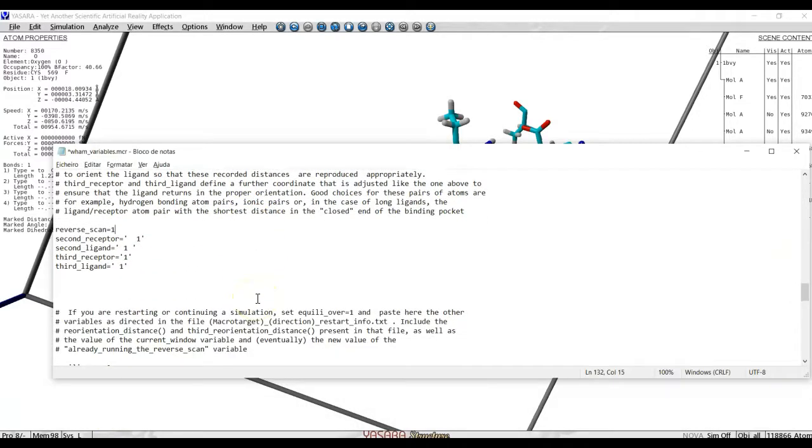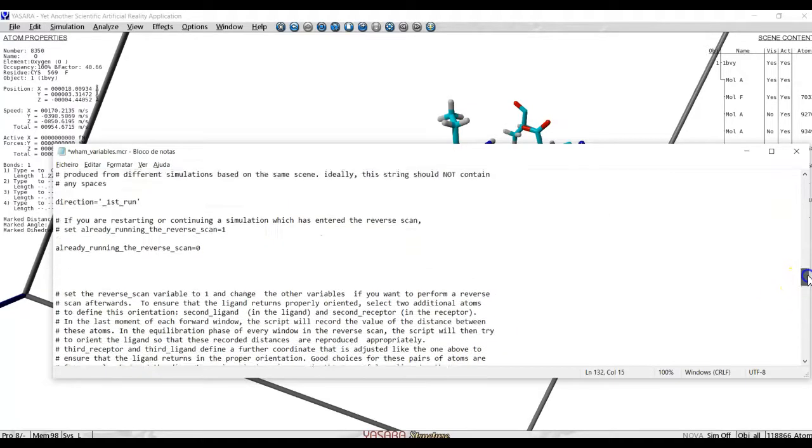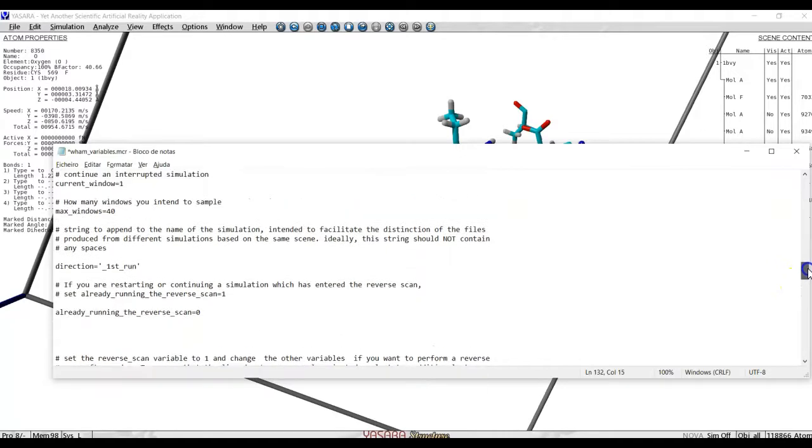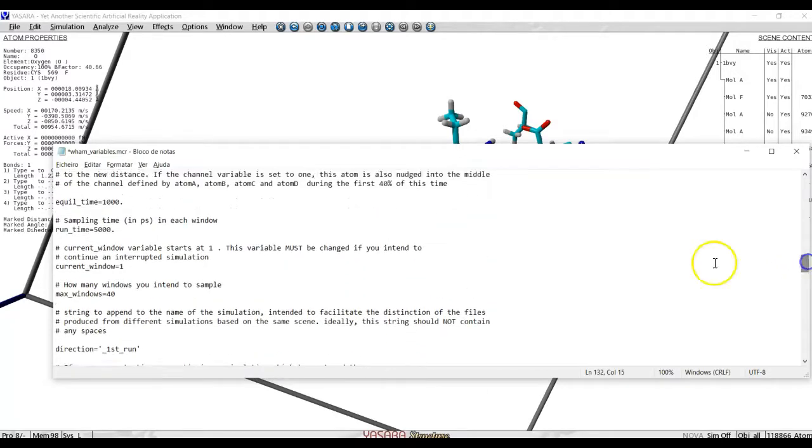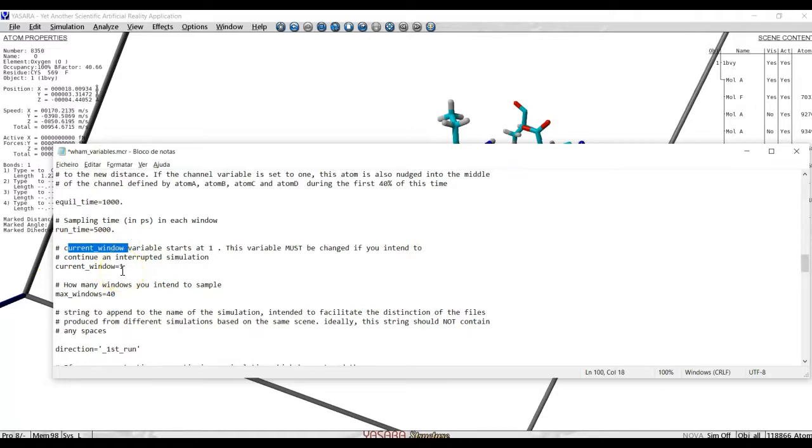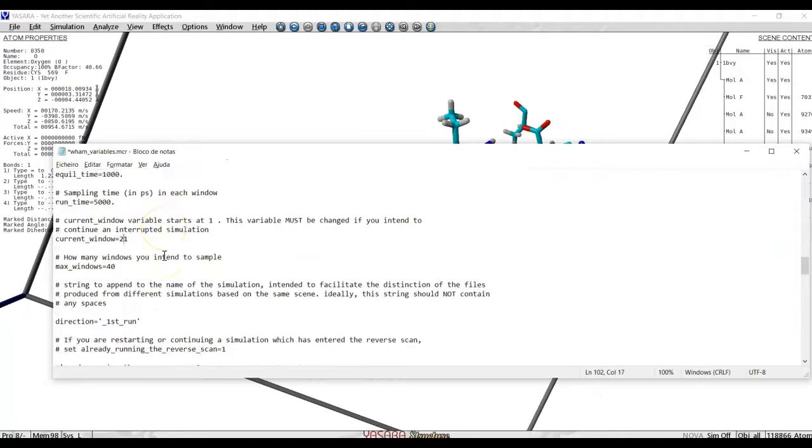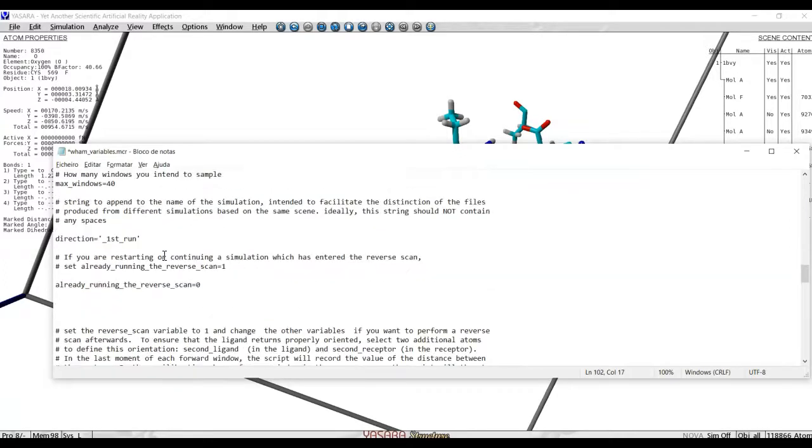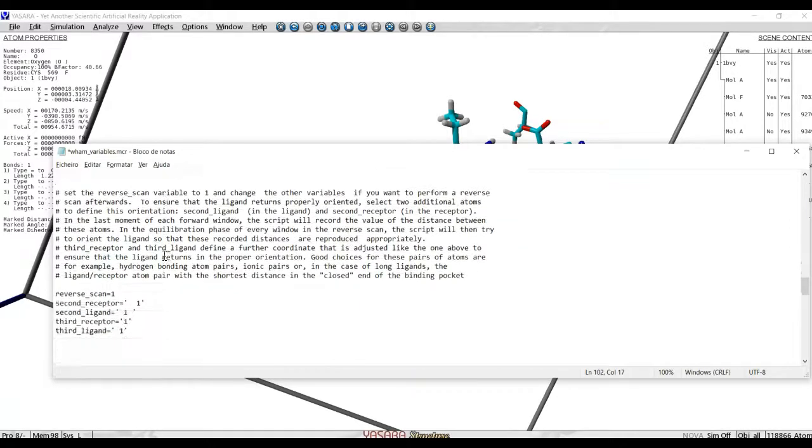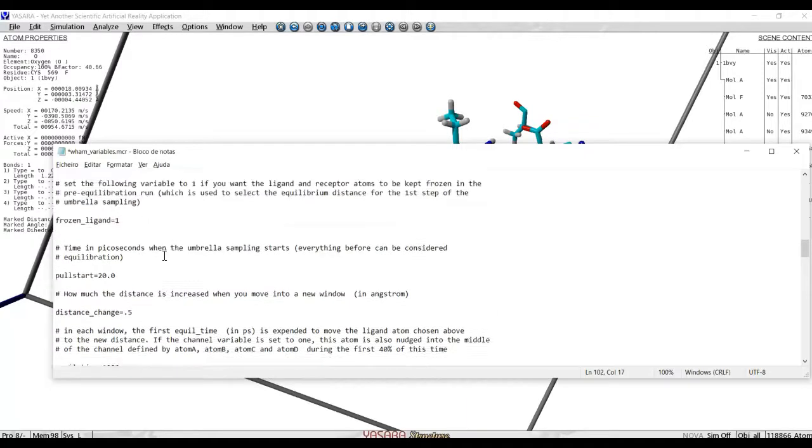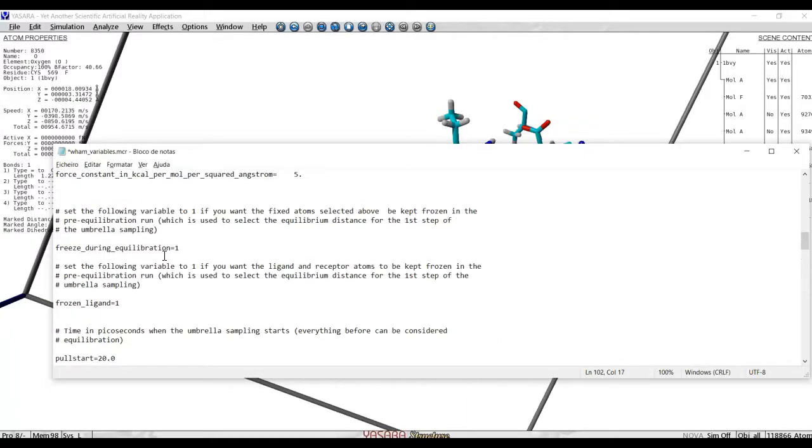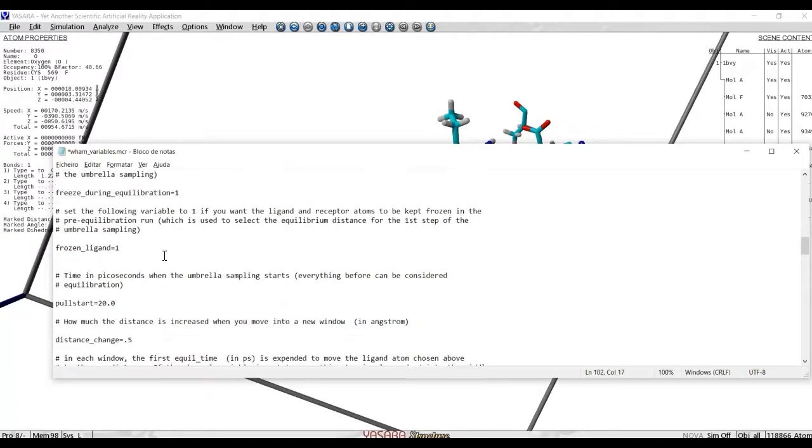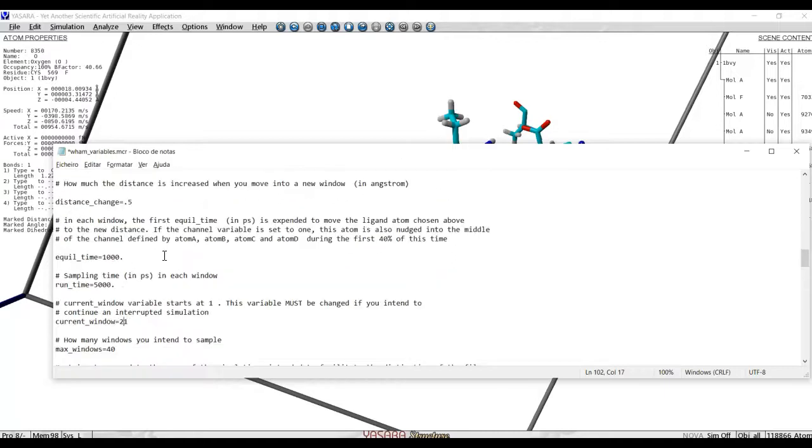What else can we look? Sometimes we want to restart the simulation. For example, we have decided, for some reason, that we wanted to do 20 windows, but then we realized that 20 windows are not enough and we want to continue. If we want to continue the scan, then we should, here, change the current window. We change, for example, we have done 20 windows and then we want to continue. So we will start with the 21st window. We change, again, the number of windows. We change it to a larger number.